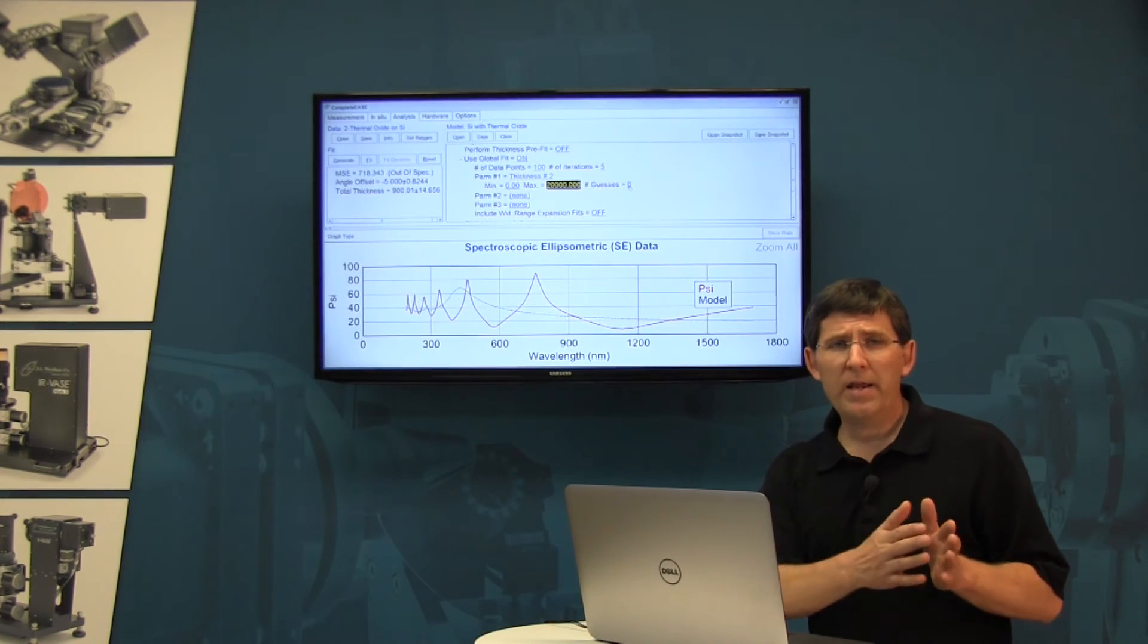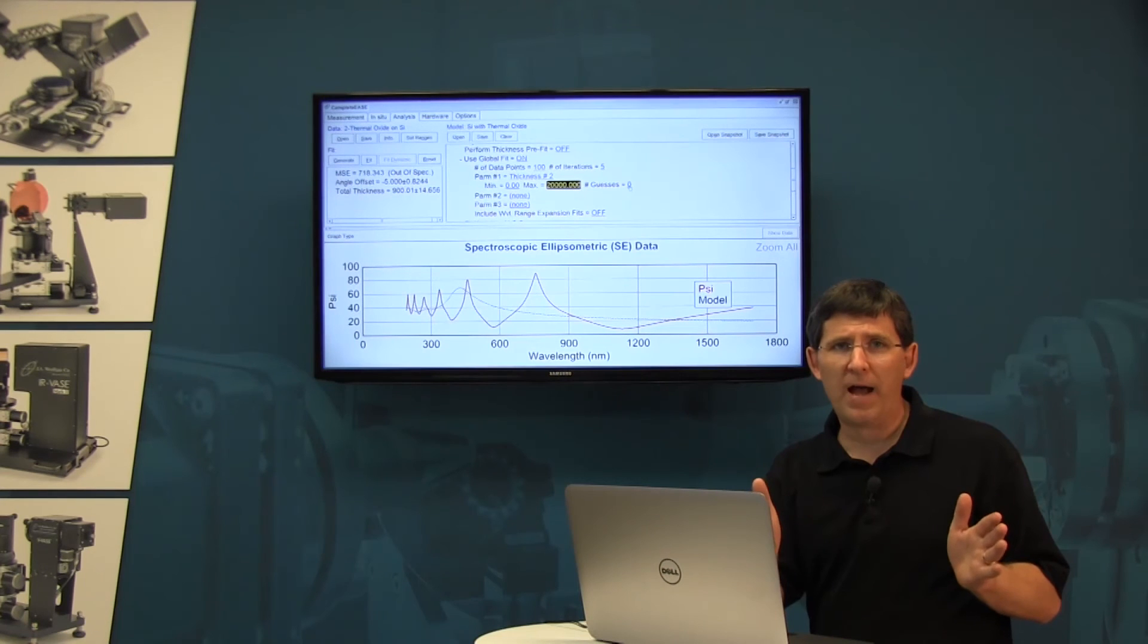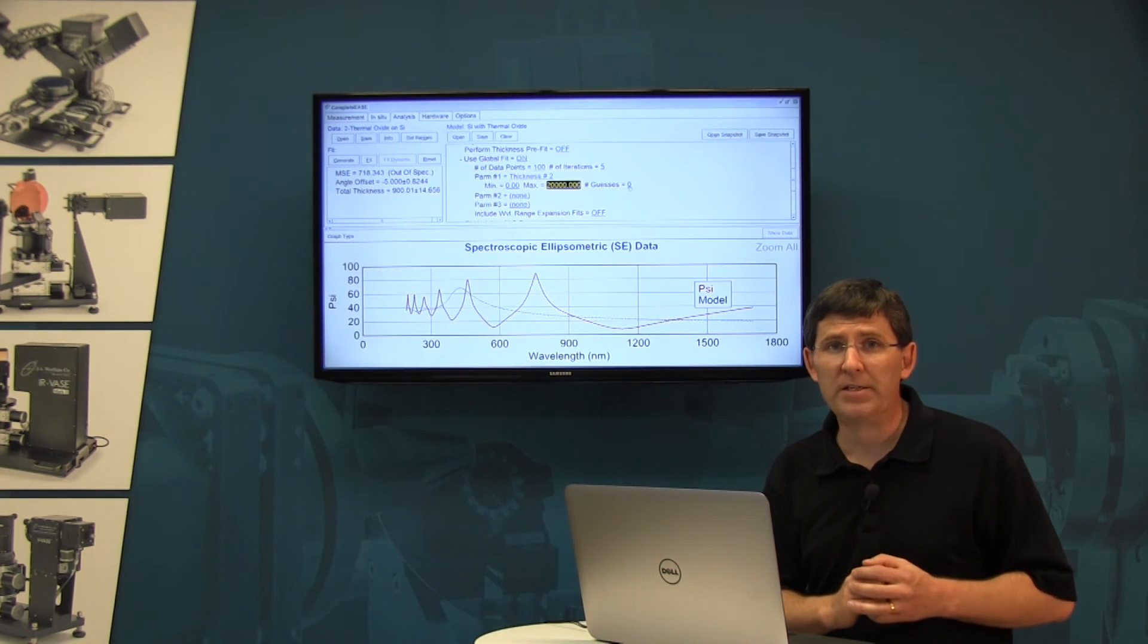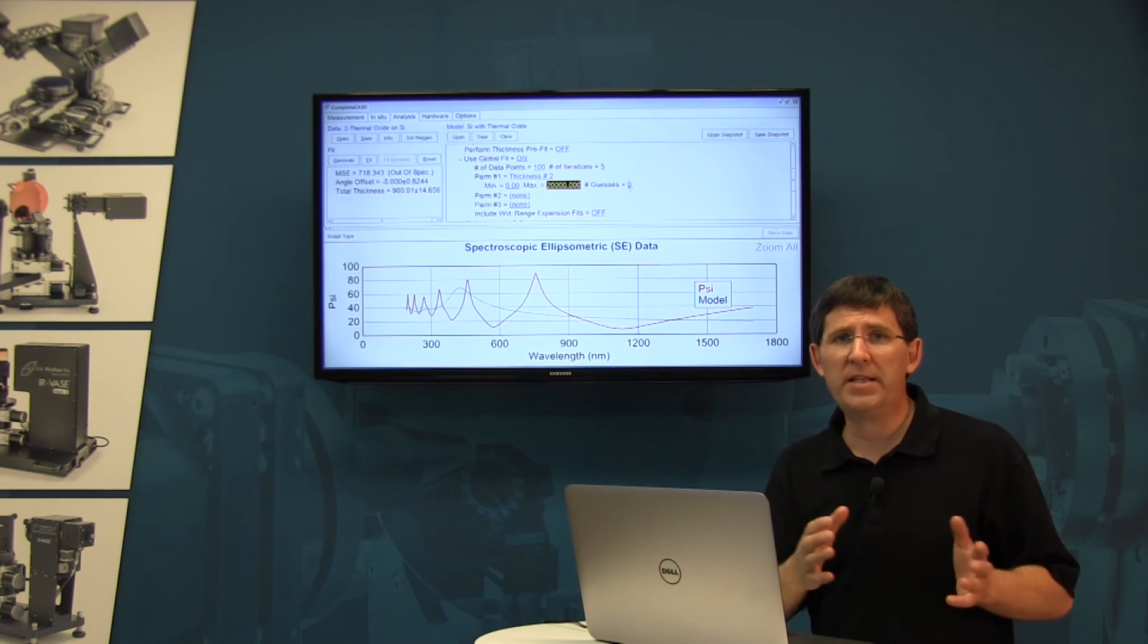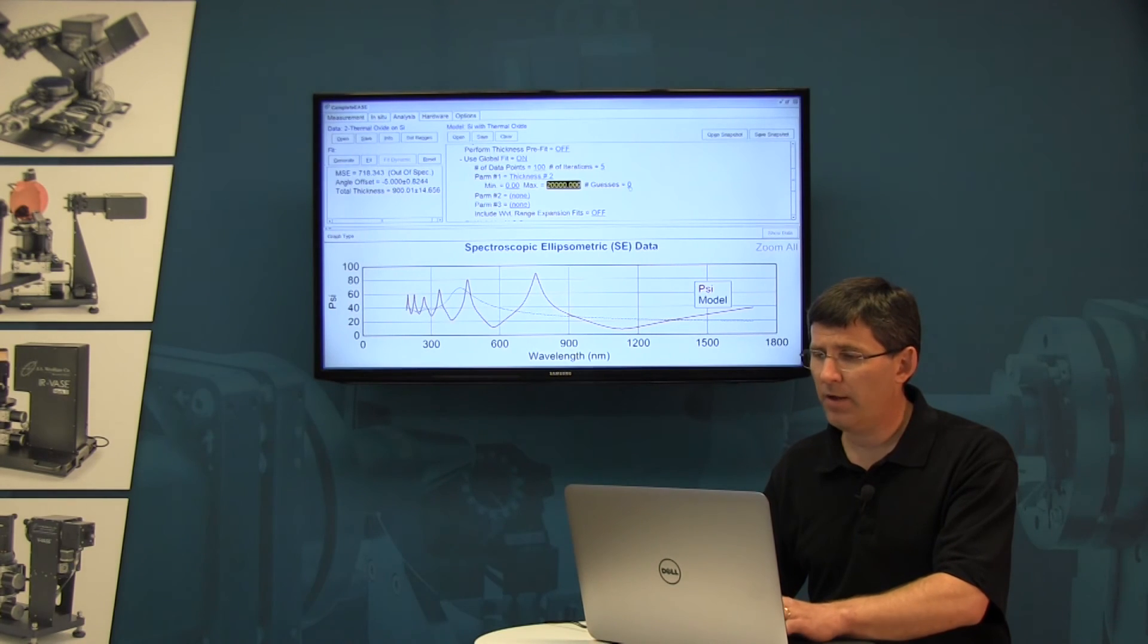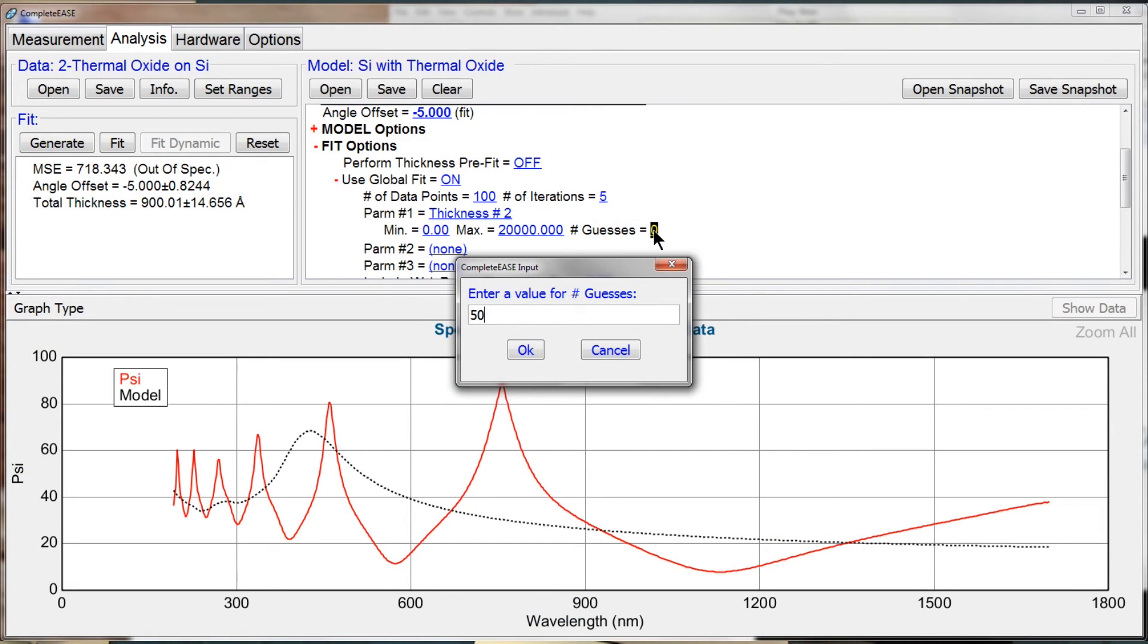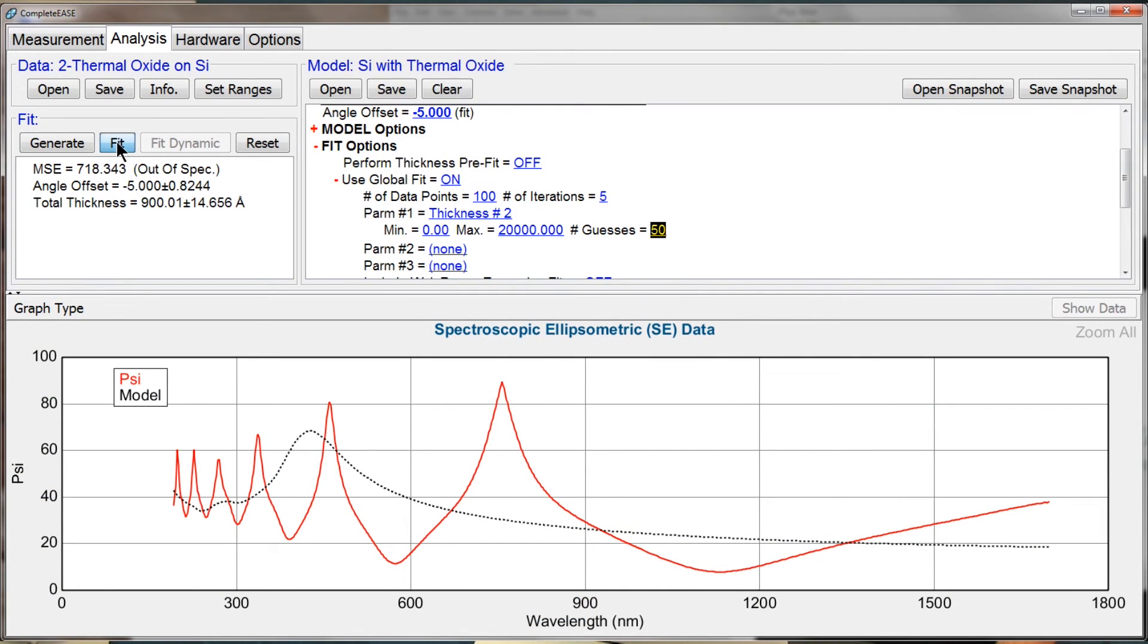The number of guesses is how it's going to equally divide up this range of thicknesses and then it's going to search what is the MSE at each one of those values. Let me type in 50 global guesses and press fit.